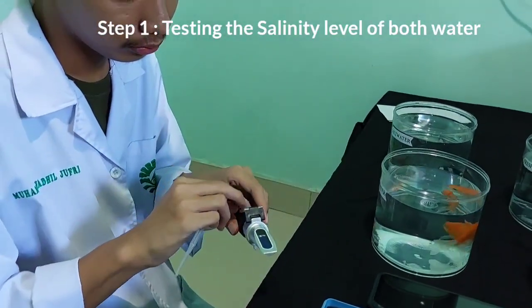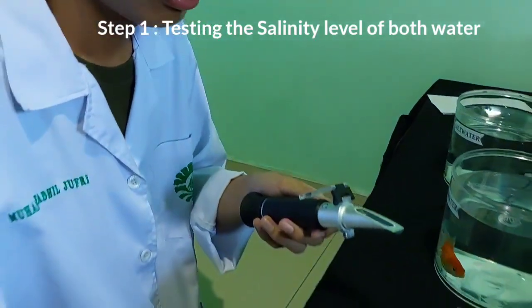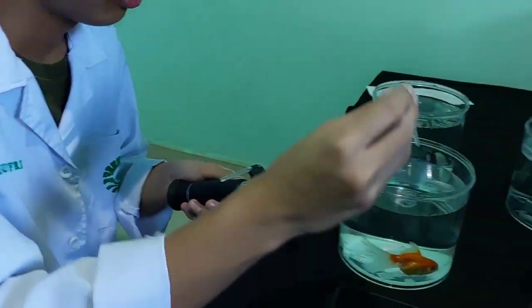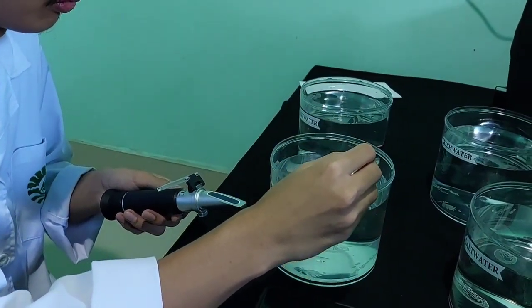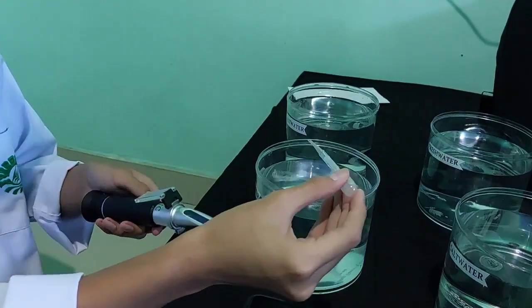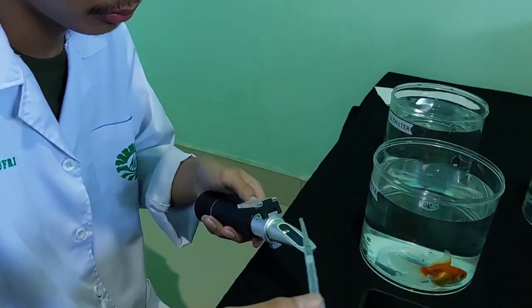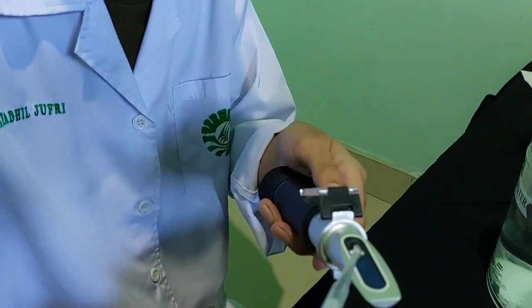Step 1. Testing the salinity level of both water. A few drops of water are taken from the jar using a dropping pipette. The water is dropped onto the surface of the refractometer prism.